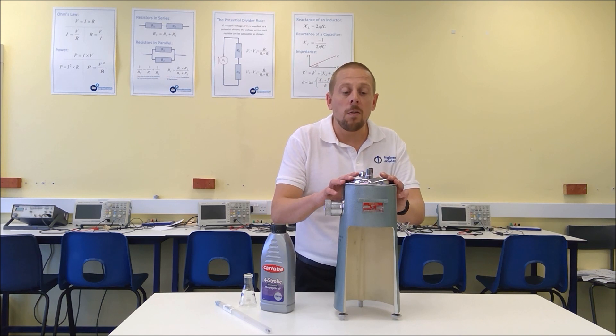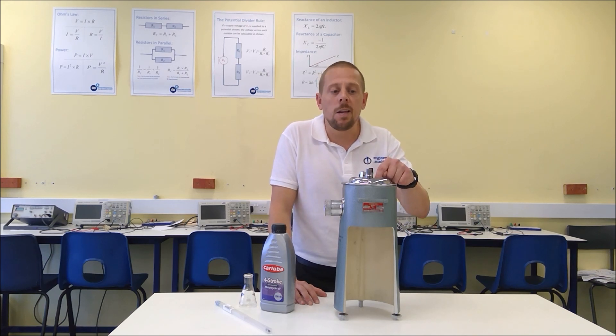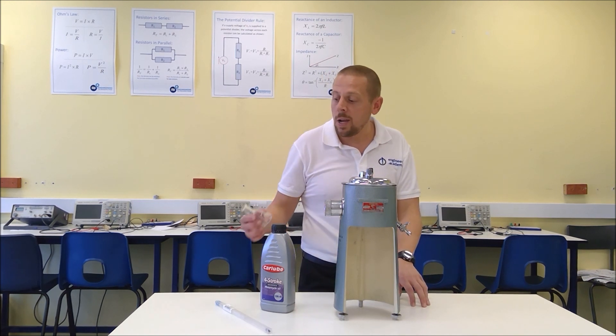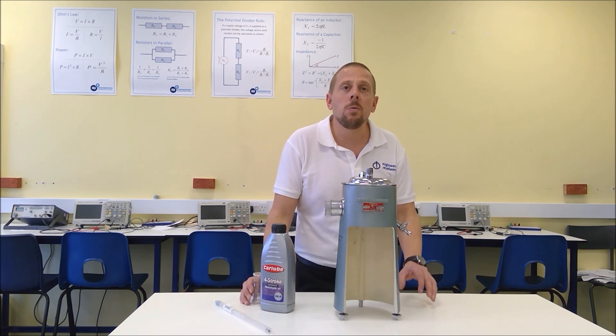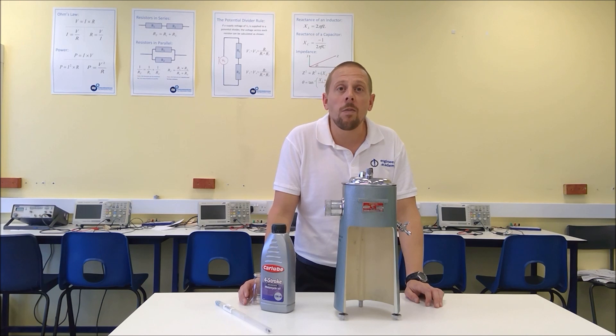The piece of apparatus in front of me here is called a Redwood viscometer. The way it works is that we have a vessel in the center where we're going to place the oil, and we're going to time how long the oil takes to drain through a small orifice in the bottom until we collect 50 millilitres. We're going to do this at various different temperatures, so around the outside of the vessel we have a water bath.